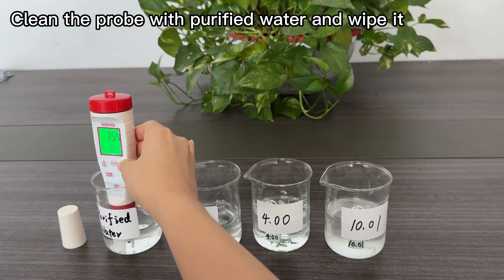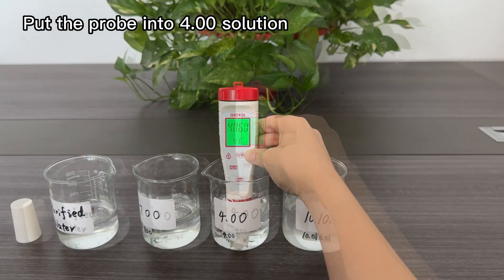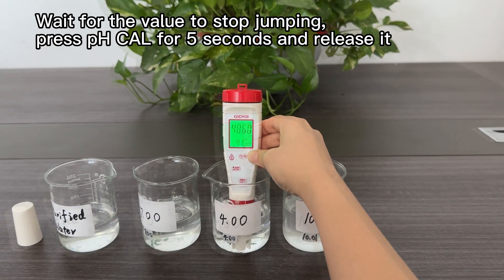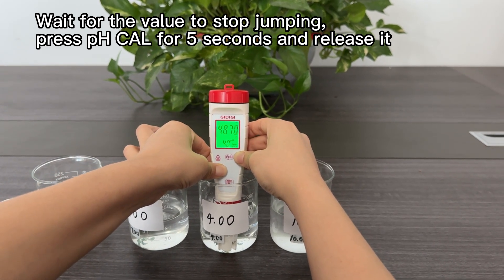Clean the probe with purified water and wipe it. Put the probe into the 4.00 solution and wait for the value to stop jumping. Press the pH calibration button for 5 seconds and release it.